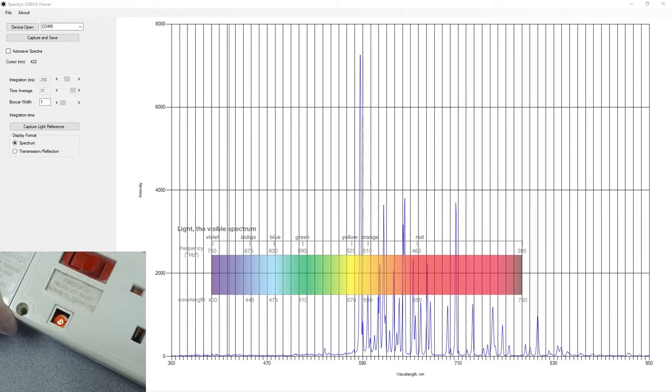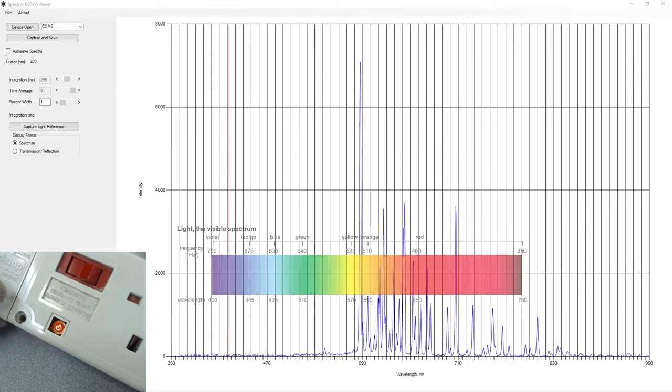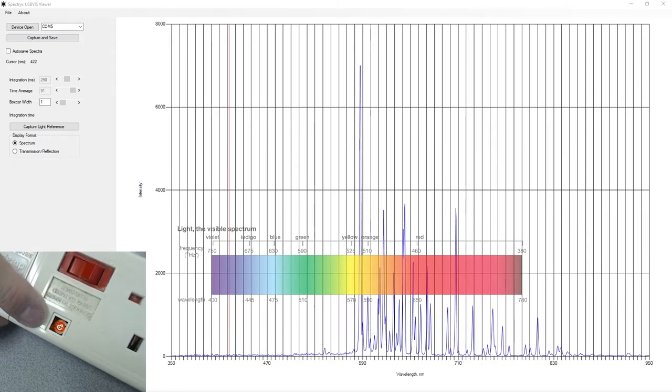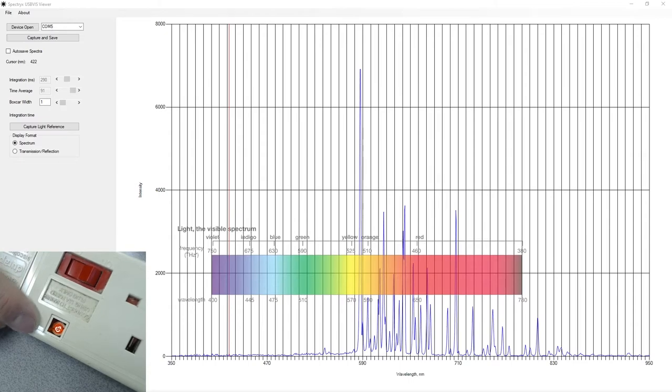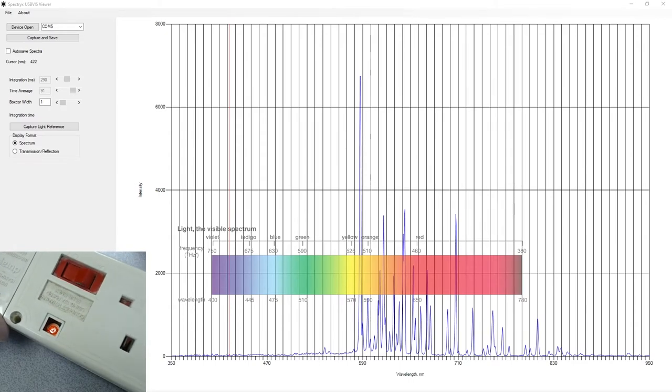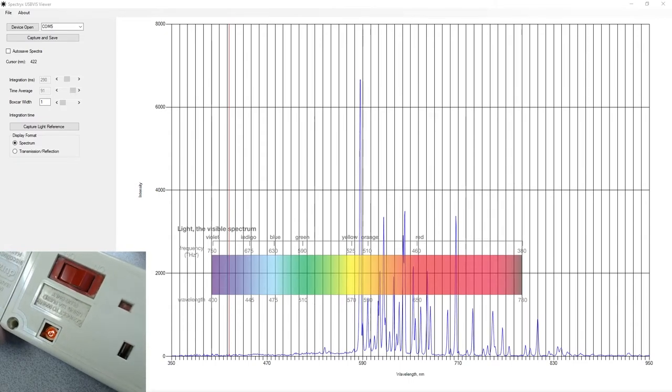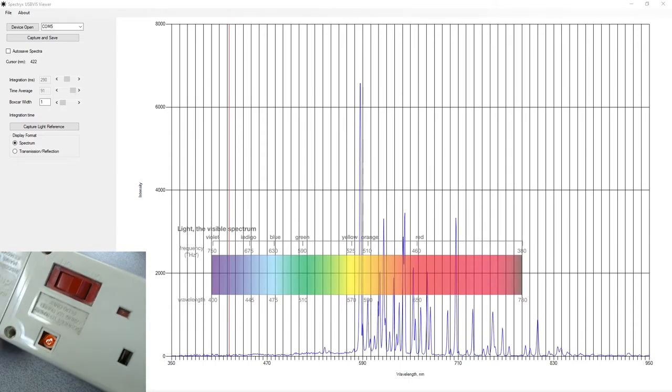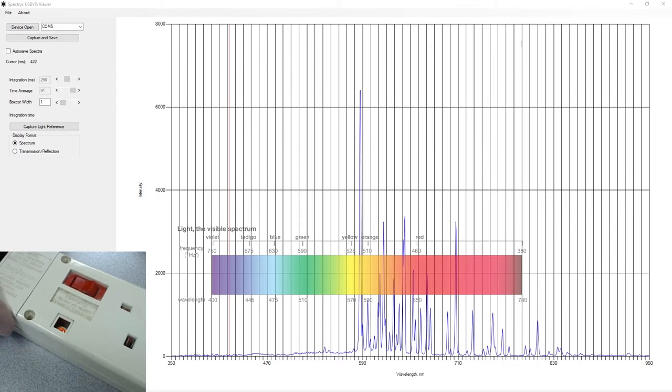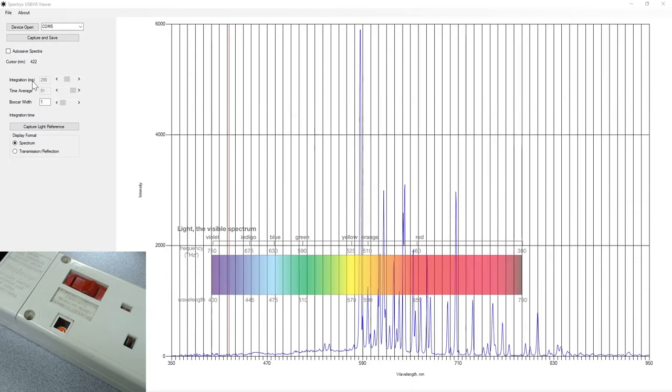So there is the neon light that we've been looking at. Essentially these are quite cheap to get, but then you'll have to wire it up. I just thought I'm sure I've got something down in my cellar that will do the job. And so there it is. I have a long integration time in milliseconds here and a long averaging time.